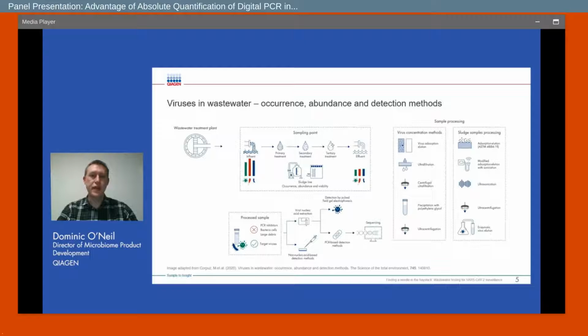And so for that, the wastewater treatment plant is going to be the natural place to do this testing, as it will gather in sample from an entire catchment area, giving you a broad cross-section of the population, and then looking directly at the influent sample coming in before it goes to any treatment that could potentially decrease the signal, aside from potentially looking at the sludge that is settled out, is going to probably provide the best sensitivity.